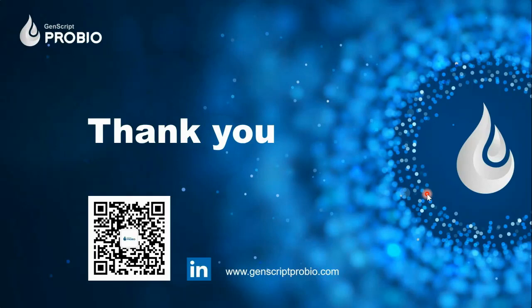Thanks, Dr. Ali. The next question, what is the most difficult process to get high yield of purification? Compared with AAV DSP, why does the lentiviral purification process show low recovery?